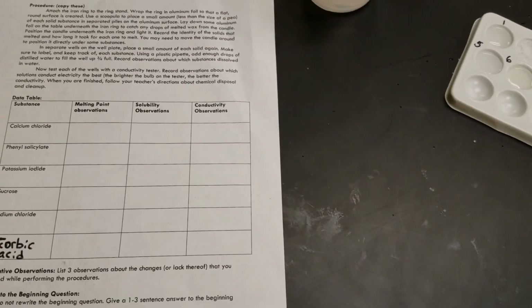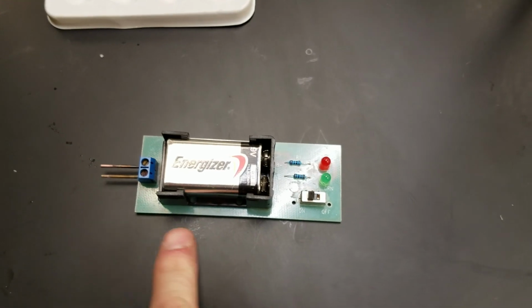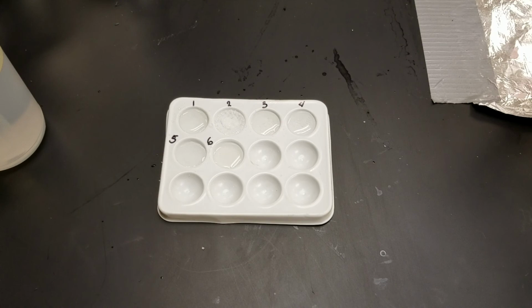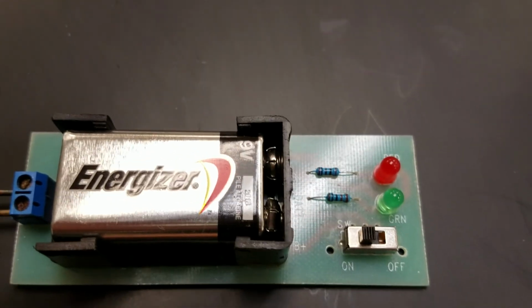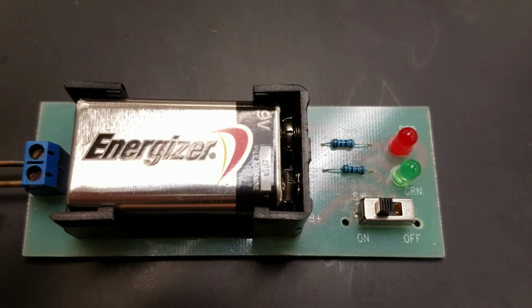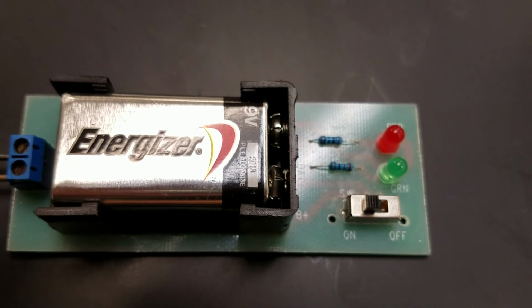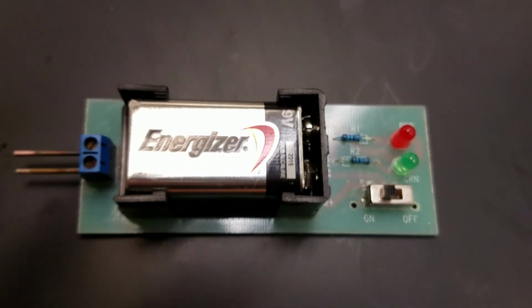The next step is to test conductivity, and for that we have a conductivity tester. We're going to put these 2 metal leads into the solutions that we've already made. If it lights up with only a red light, we have a low conductivity. If the red light lights up and the green one lights up also but is dim, we have medium conductivity. And if both red and green light up brightly, then we have high conductivity. So let's test that right now.